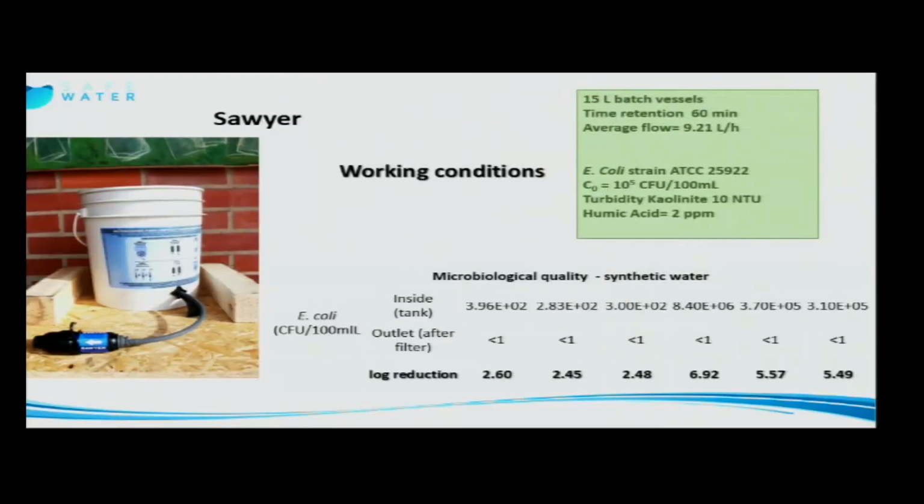This is a Sawyer filter, a filter that was evaluated at the university that uses a special ultrafiltration filter. And in this case, the system alone achieves a very good removal of the E. coli.